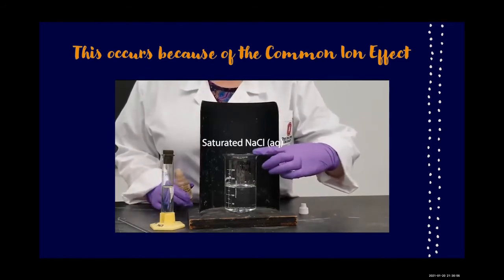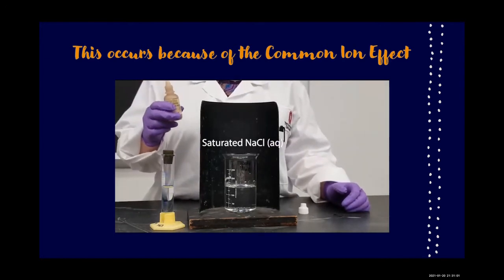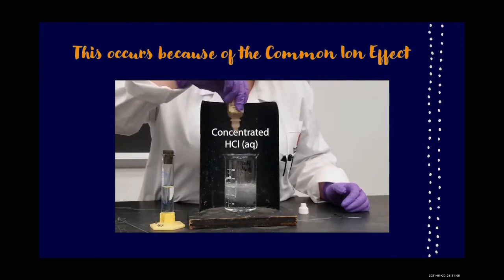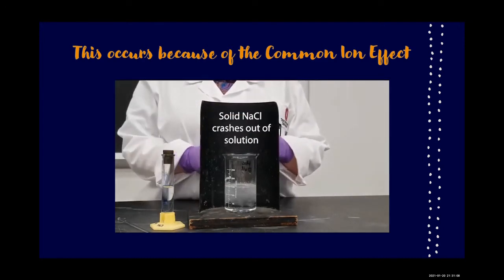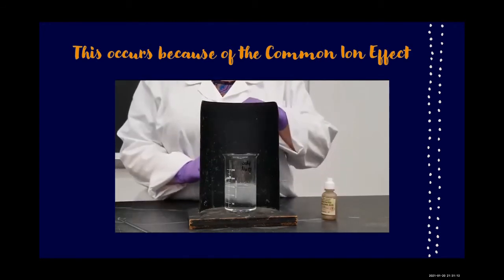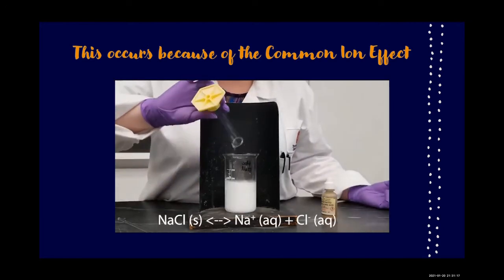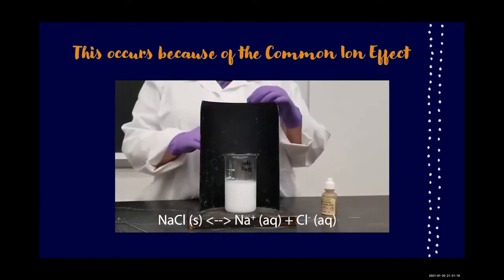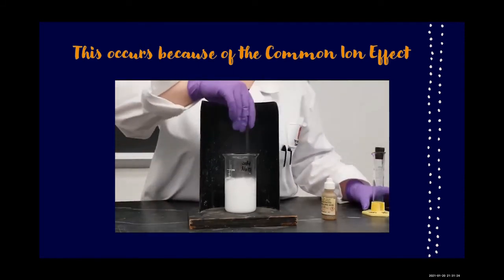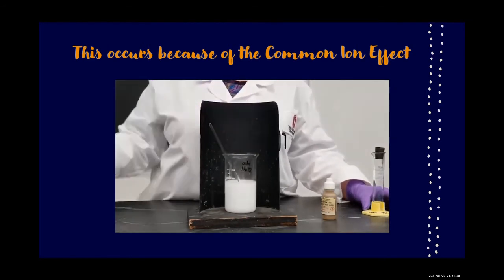Here I have a saturated NaCl solution. I'm going to add some concentrated HCl to that. So what's the ion in common? The white stuff you see is solid NaCl coming out. Now I'm going to add a large amount of concentrated HCl. That white precipitate is solid NaCl crashing out of solution.